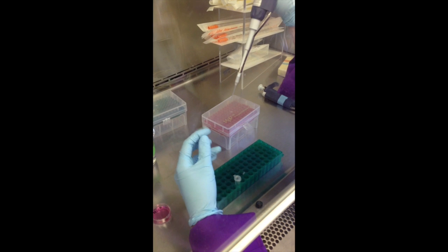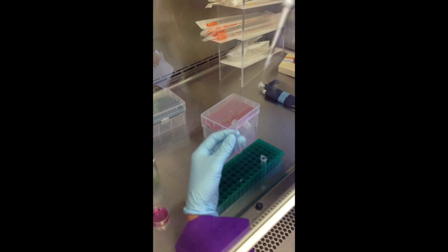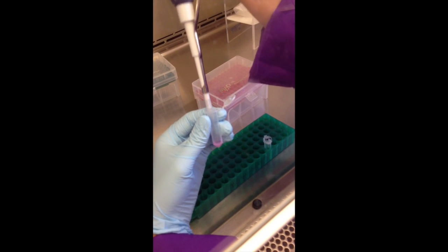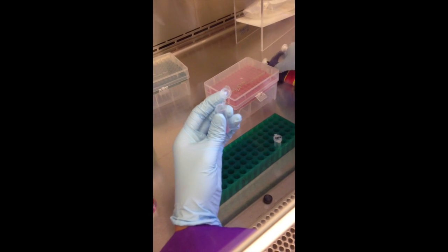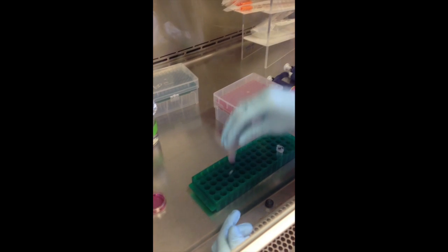The protocol will tell you how much plasmid to add, and it's really important to add the DNA plasmid right into the solution. Then tap it and let it incubate for 15 minutes.